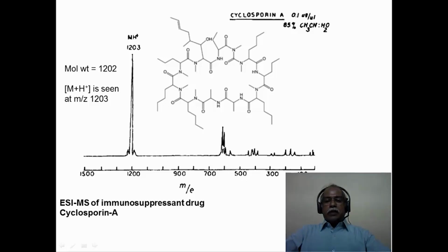A doubly protonated ion could be seen, for example, and this could be a triply protonated ion, and so on, depending upon how many protons are added to the substrate to give the specific ion. However, the most intense peak is the protonated species in this particular case.